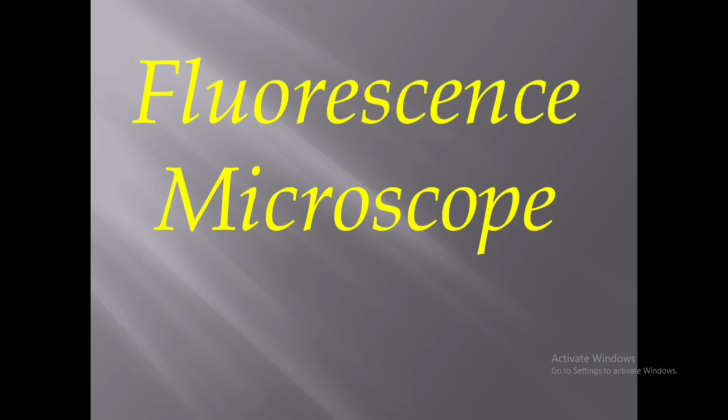I am Dr. Swati. In this series of lectures we are discussing different types of microscopes. We have seen the light microscope and the dark field microscope. Now in this video we are going to see the fluorescence microscope.